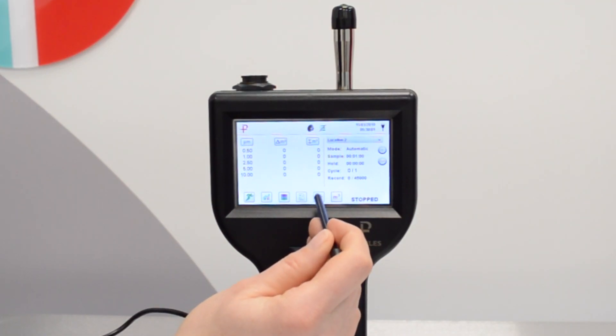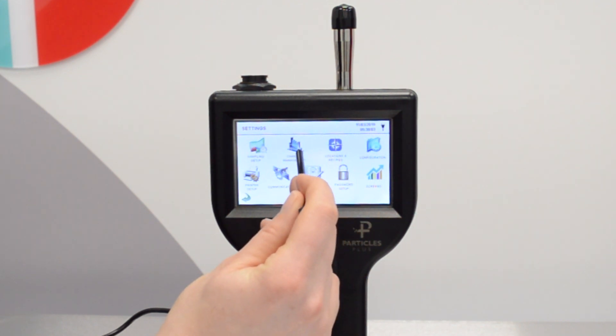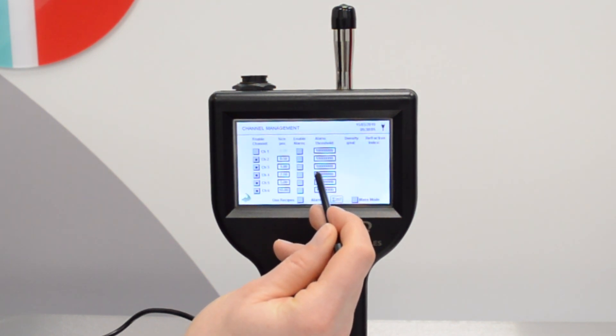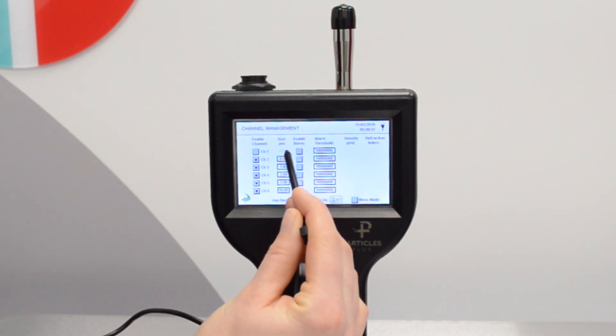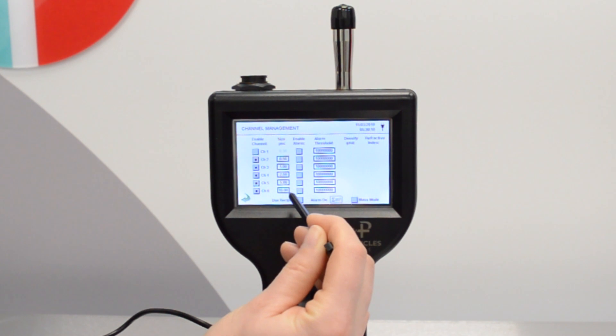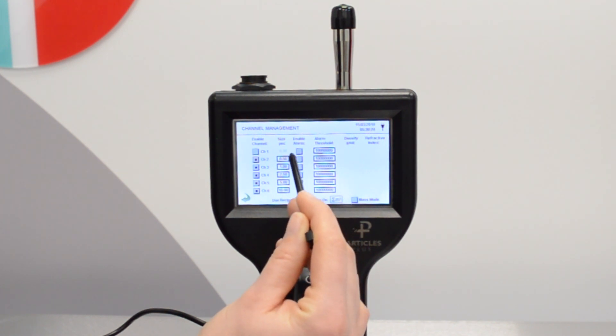From the home screen if you tap on settings you can change the channel size and turn channels on and off. You can't edit the first one as that is fixed to 0.3, but you can change other sizes of the other five channels. The range is from 0.3 to 10 and we'd recommend using channel sizes that are aligned with the ISO standard.